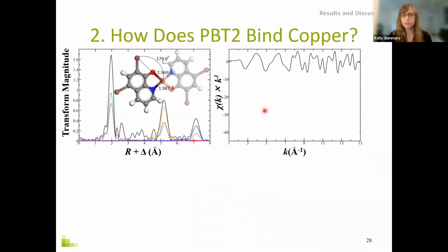To look into this a little bit further, I know the slide looks really busy, but we'll go through it piece by piece. As I've mentioned here, in many of these compounds, the copper, oxygen, in this case is iodine, just because the peaks are much bigger, more distinct to see. This angle is really approaching 180 degrees.